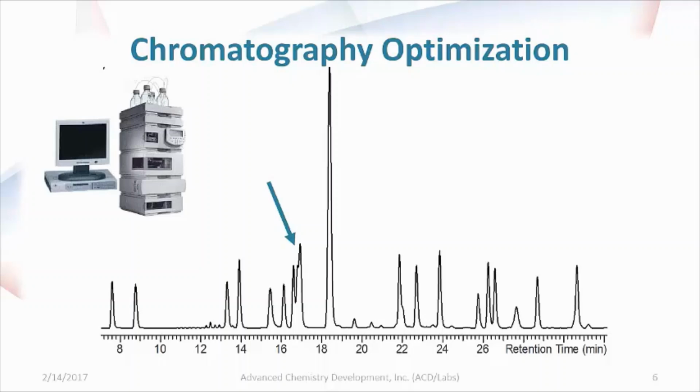Another particular scenario that could be presented is you're trying to develop a method for a release lab, so you need to cut down the time of your chromatographic separations. And often there are many variables that can be taken into account to lower the amount of time. So you can see how the problem can quickly snowball and become more complex.